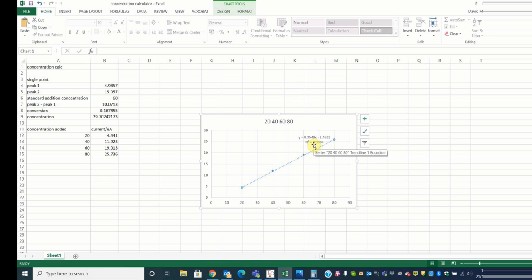If this R² value is above 0.999, then every increase of current is proportional to the increase in concentration, and this is the method by which the arsenometer unit can determine concentrations of samples.